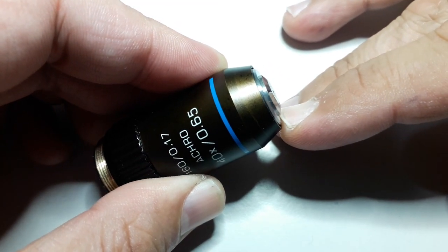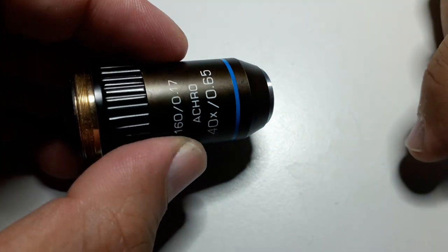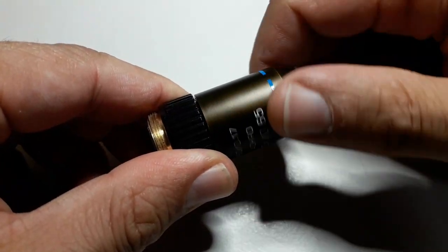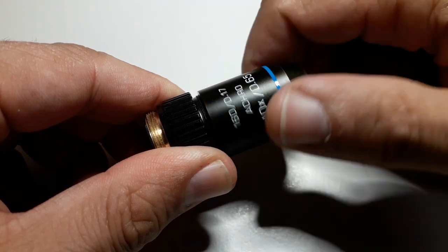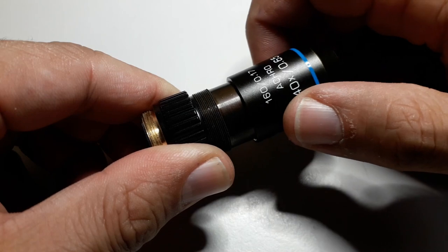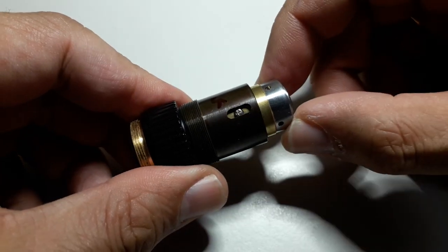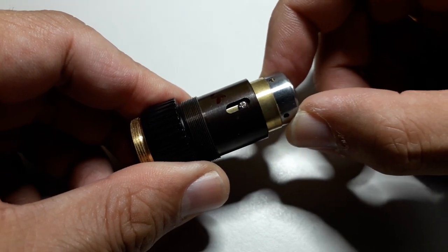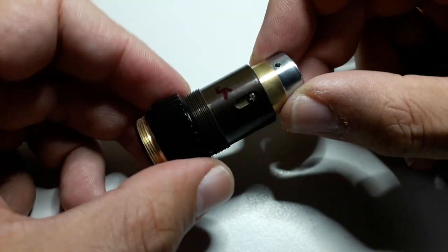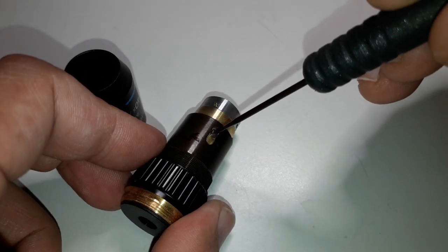It happens to be a so-called spring-loaded objective. There is a spring in there which protects the front lens when you crash the objective into the slide. What I'm doing right now is I'm simply unscrewing the cover here, and I'm doing this in real time — no shortcuts. You can see there is also a small screw in there that holds it in place. I decided I'm simply going to remove this screw first.